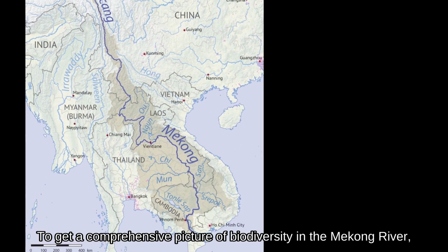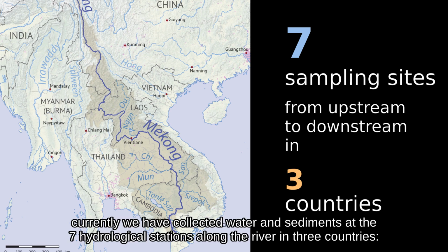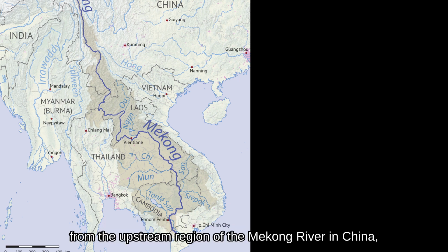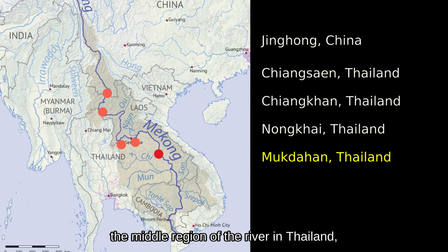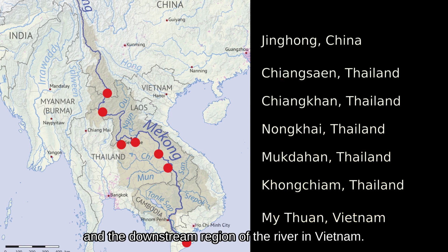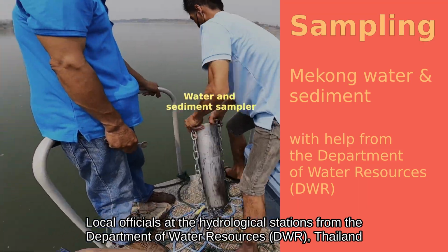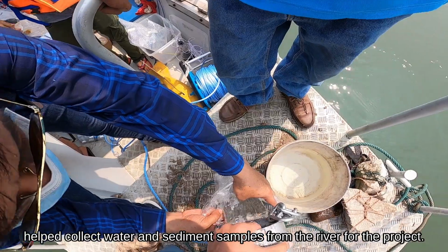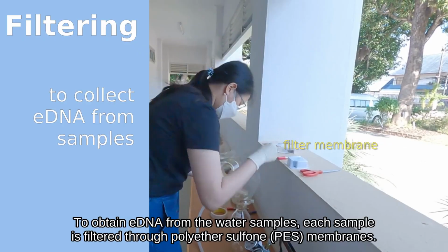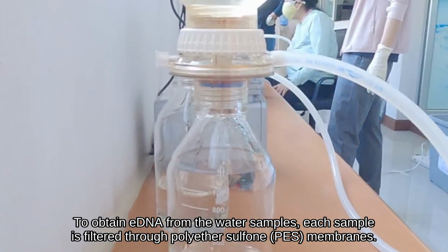To get a comprehensive picture of biodiversity in the Mekong River, currently we have collected water and sediments at the 7 hydrological stations along the river in 3 countries. From the upstream region of the Mekong River in China, the middle region of the river in Thailand, and the downstream region of the river in Vietnam. Local officials at the hydrological stations from the Department of Water Resources helped collect water and sediment samples from the river for the project. To obtain eDNA from the water samples, each sample is filtered through polyether sulfone membranes.